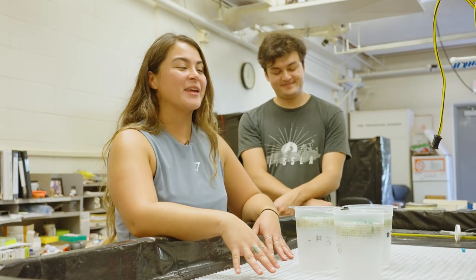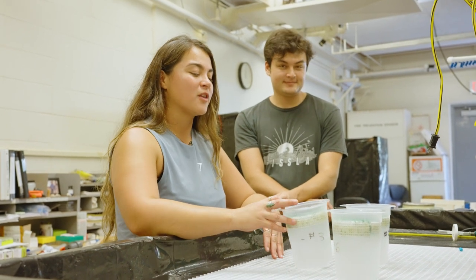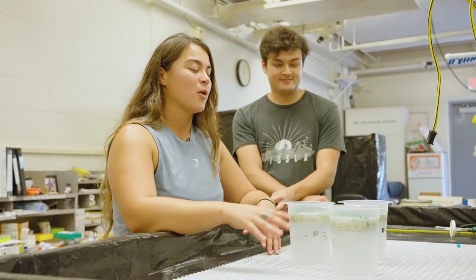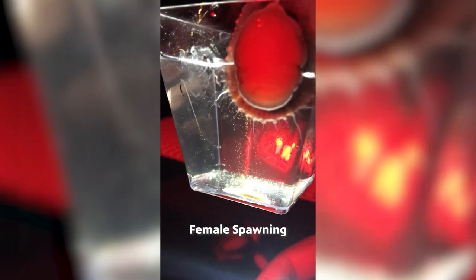Over here is where we spawn our OPE. Once we get broodstock from the wild or from our tanks, we'll put them in these grass-lined beakers where we just wait and see until they spawn. It's an overnight process, but once they release sperm or egg, we're able to fertilize and move on to the next stage of settlement.